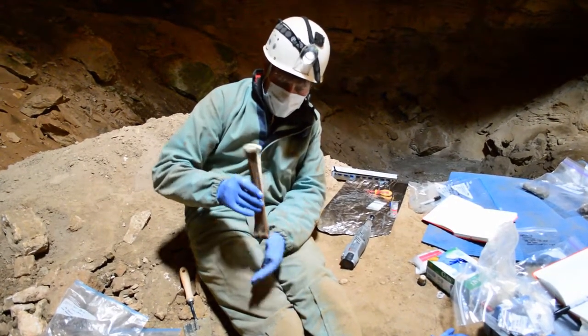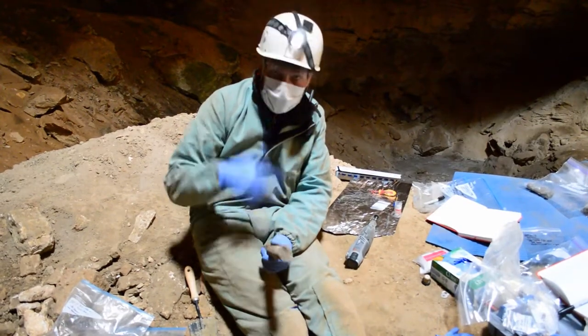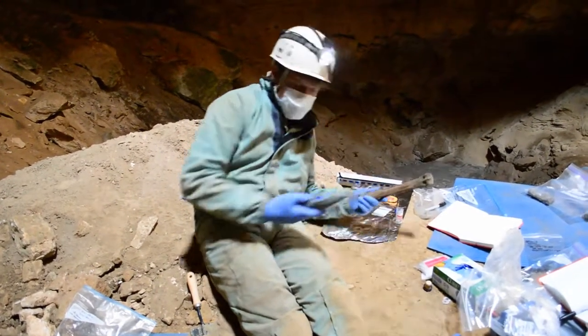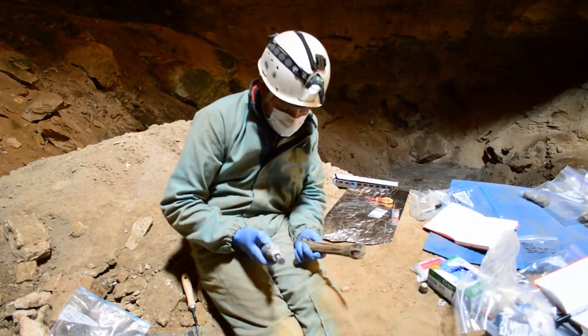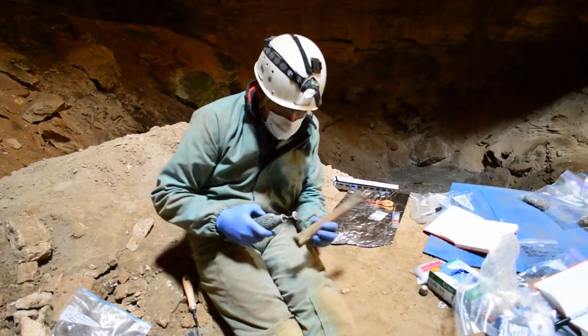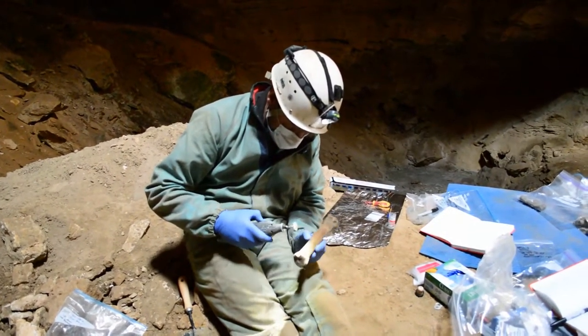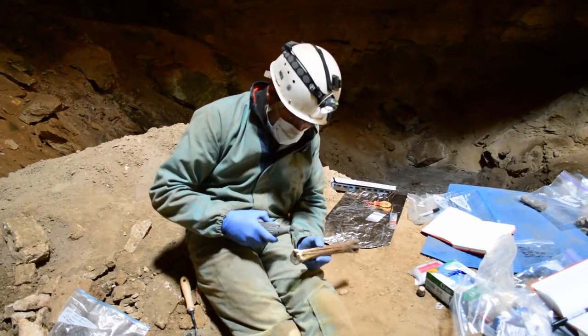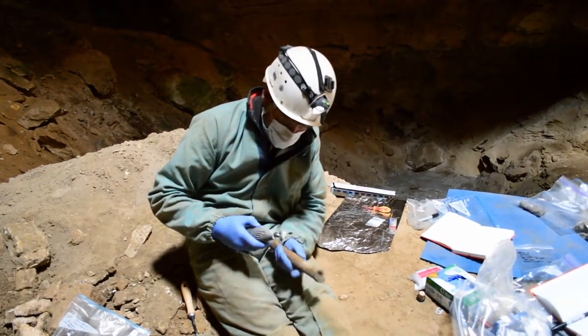They think they're adapted to hard ground, traveling on hard ground. So what I'm doing here — hence the mask and gloves — is sampling. I'm using a Dremel drill with a carborundum cutting disc on the end of it, and effectively I'm cutting out a chunk of bone here.